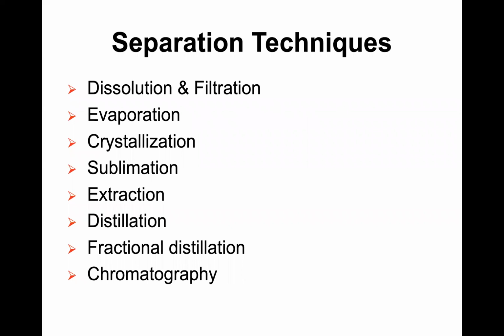So here is the list of different separation techniques. We can also call them separation methods, or we can also call them separation tools. The first one is dissolution and filtration. Then we will look at evaporation, crystallization, sublimation, extraction, distillation, fractional distillation, chromatography.